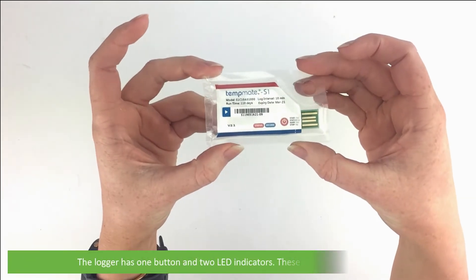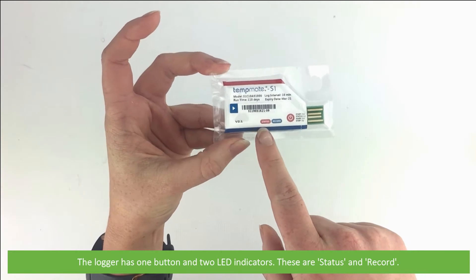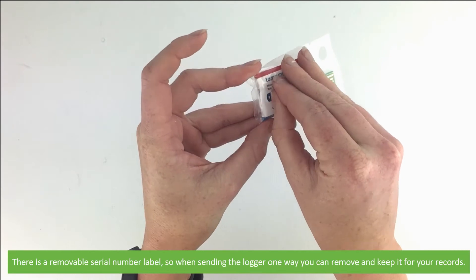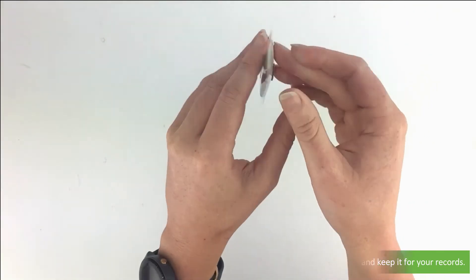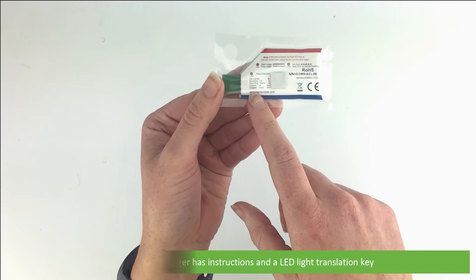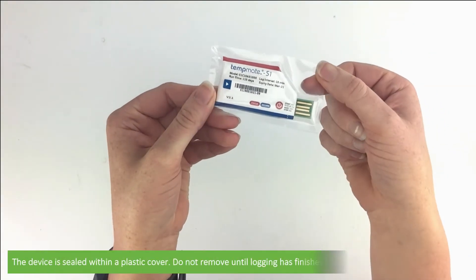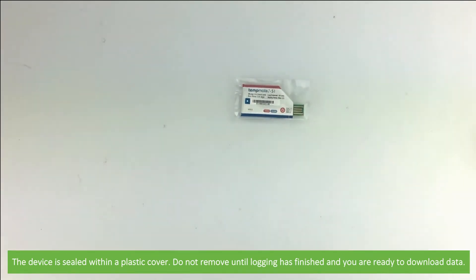The logger has one button and two LED indicators - these are the status and record LEDs. There is a removable serial number label, so when sending the logger one way you can remove it and keep it for your records. The back of the logger has instructions and an LED light translation key, and last of all there is a sticker for mounting. The device is sealed within a plastic cover - do not remove it until logging has finished and you are ready to download the data.